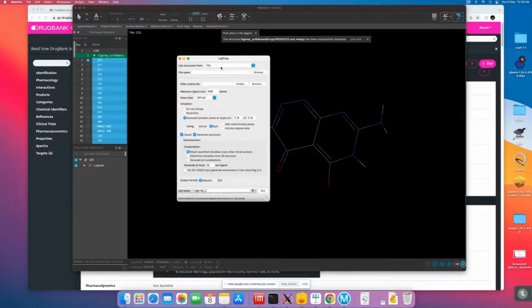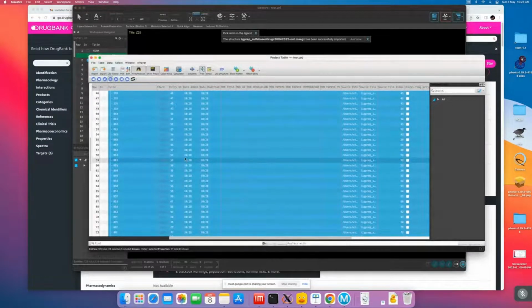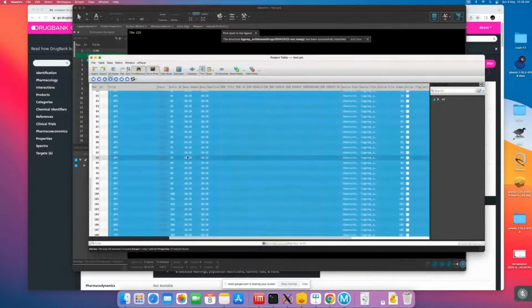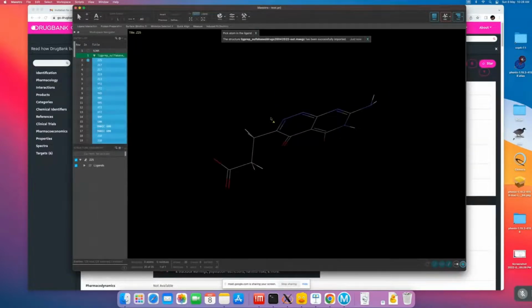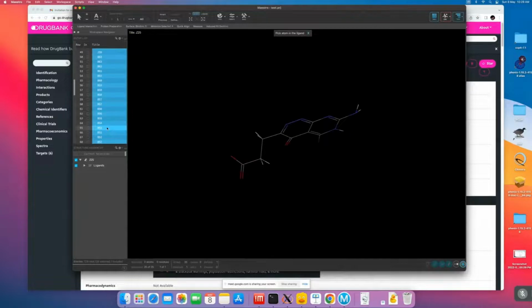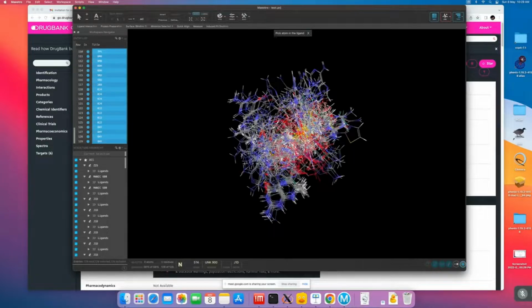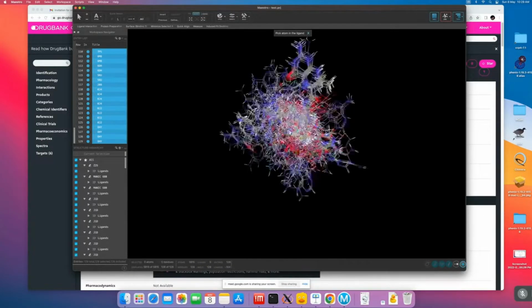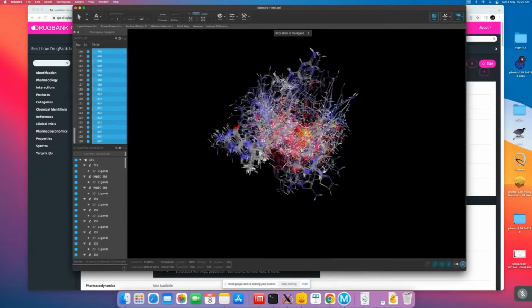And then you can use structures from file, or you can use structures from project table, which is over here. All the structures which have been selected are in the project table, and in the workspace there's only one as of now. If you want to use all the structures in the workspace, you just click on Shift and select on these points. So you can see these are all the ligands which have been pre-processed and not yet docked onto the structure, right?